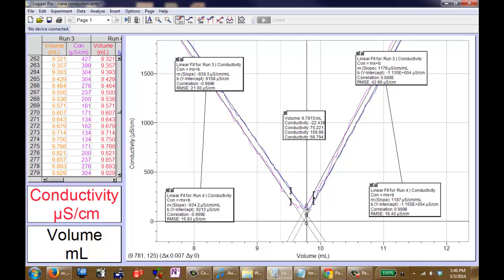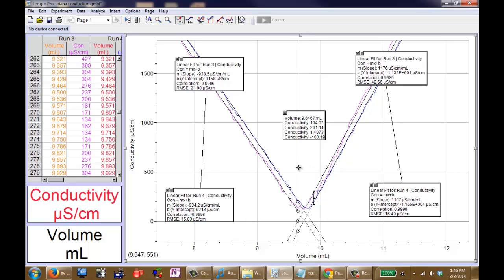For the second run we had a point of equivalence at 9.793 milliliters. This is the way that the points of equivalence are determined using the conductometric information.